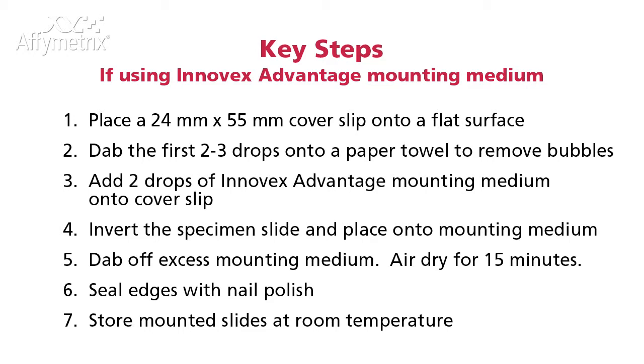Place a 24mm by 55mm cover slip onto a flat surface. Dab the first two to three drops onto a paper towel to remove bubbles. Add two drops of Inovex Advantage Mounting Medium onto a cover slip. Invert the specimen slide and place onto mounting medium at an angle. Dab off excess mounting medium and air dry for 15 minutes. Seal the edges with nail polish and store the mounted slides at room temperature.